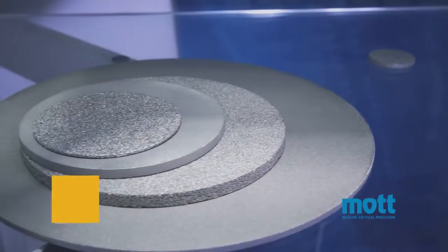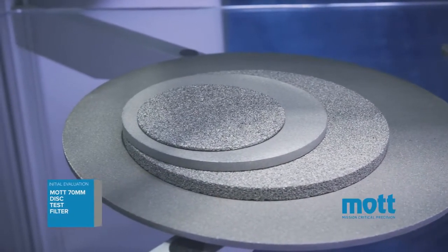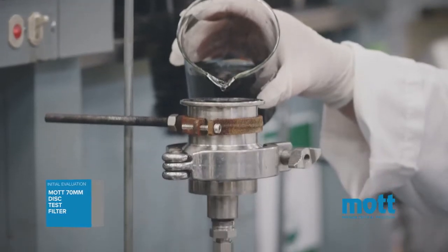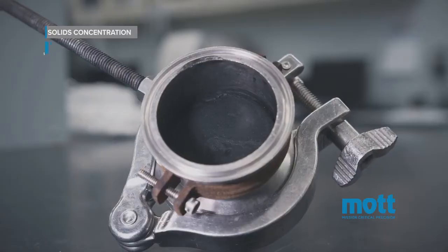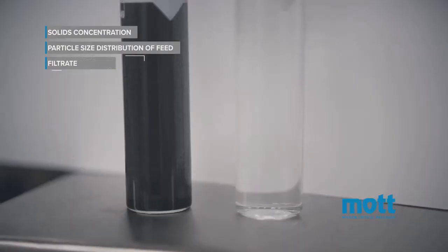Initial evaluation uses the Mott 70 millimeter disk test filter for separation of your feed sample to determine solids concentration, particle size distribution of feed, and filtrate quality.